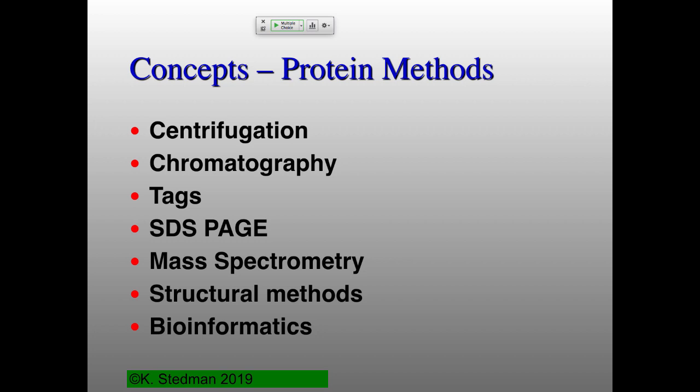Then we'll do mass spectrometry to make sure that's actually really what we think it is. So that gives you molecular masses, identifications. In terms of the structures, like these pretty structures we just saw a second ago, there are basically three ways these days now to do that.